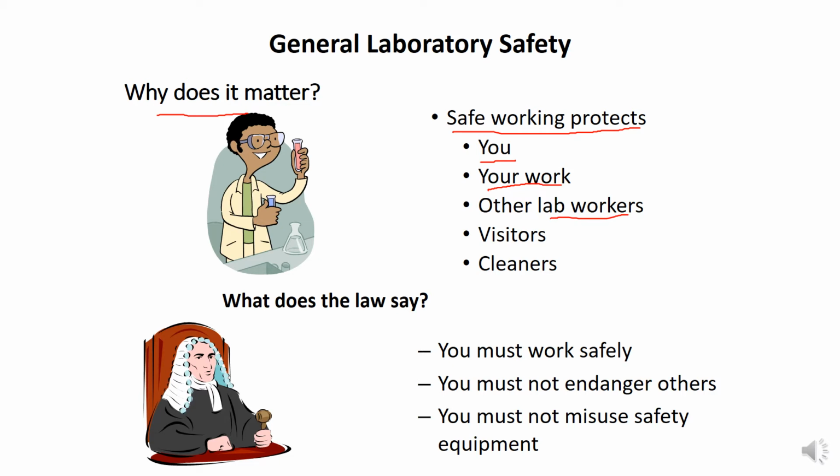It does not mean that I'm working in the lab and I'm safe, so it's okay. No, you have to be safe, and you also have to protect other people working in the lab, whether they are visitors, workers, your colleagues, friends, lab fellows, class fellows, and even the cleaners. Mostly around 4 o'clock, many cleaners come to visit the labs and take out the disposals.